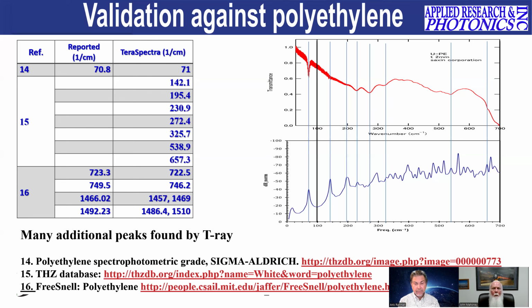So when we took the spectrum of the fullerene and compared, we were able to compare with the predicted as well as experimentally found states, and it checks out very closely. So I'm not talking about that one here, but as you can imagine, when you see more, it gives a challenge. It brings a challenge of interpretation.